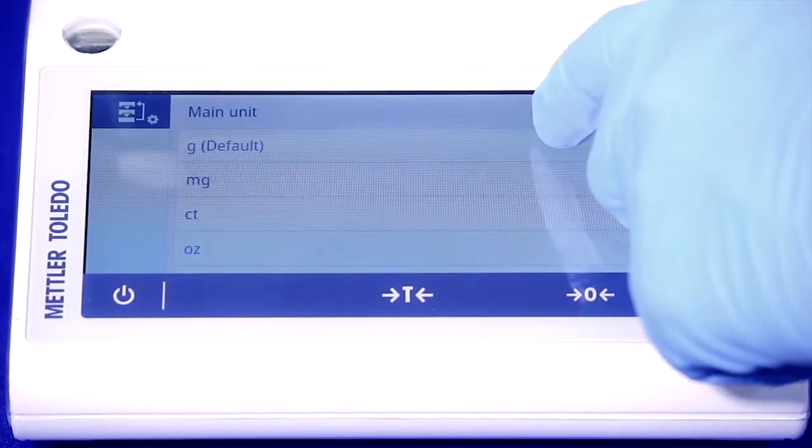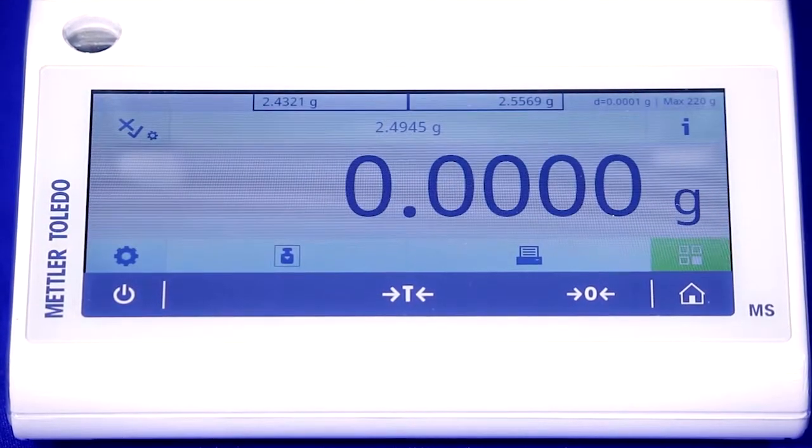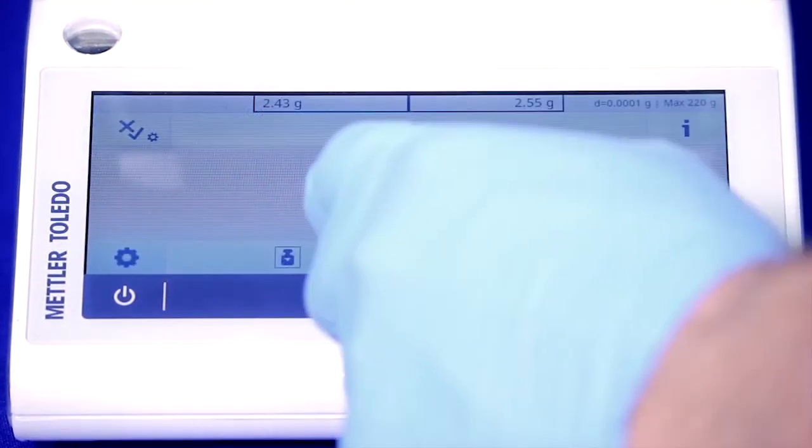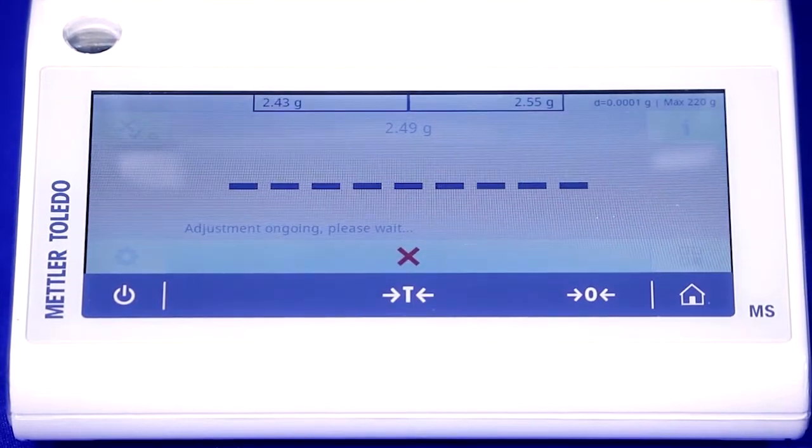It's also easy to change the displayed resolution just by clicking on the displayed number. Want to do an internal weight adjustment? Just press here. The touchscreen makes it easy for you.